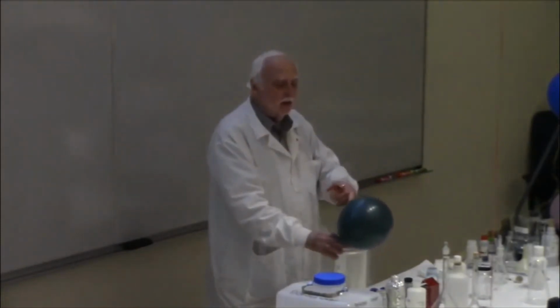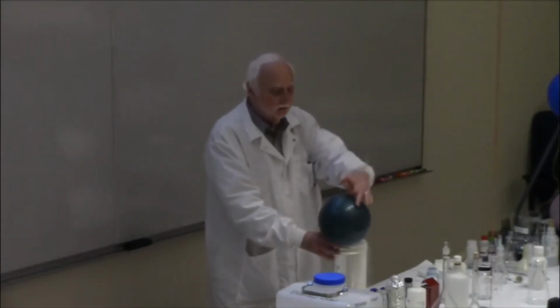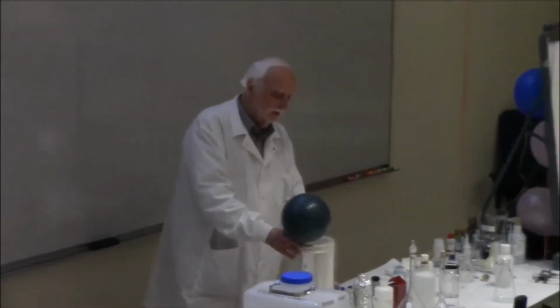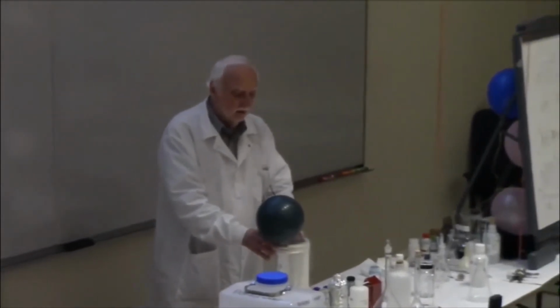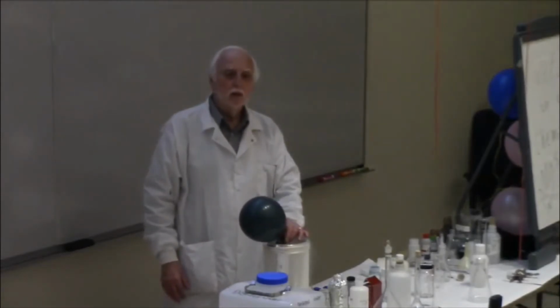So the gas is condensing back into the test tube because I put the test tube in liquid nitrogen. And the only thing colder than liquid nitrogen, well, the main one, is liquid helium.